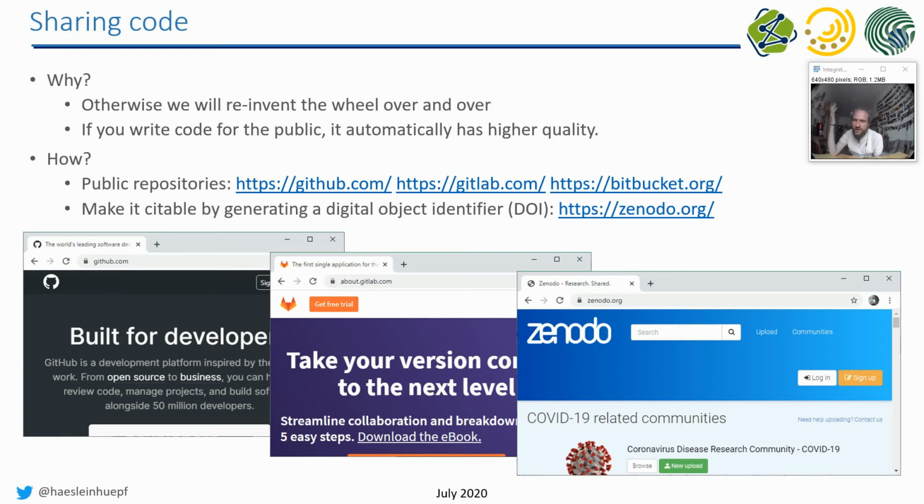So whenever you write a paper, a master thesis, whatever, put your script which does the analysis in the attachment. Do not just write about what it's doing. Put it there, and potentially also put it online, and then generate what we call a digital object identifier, a DOI. Generate an identifier for that and cite that. That makes it citable, online, accessible for everyone.